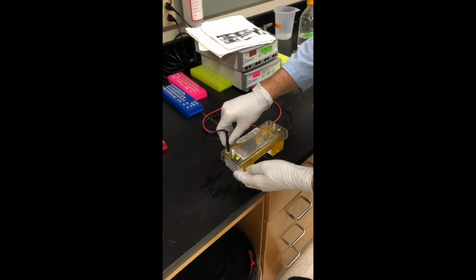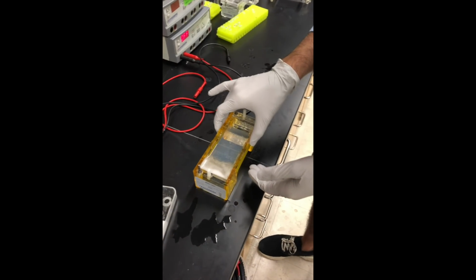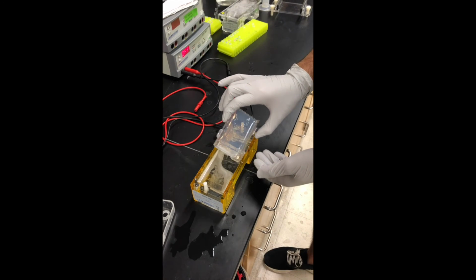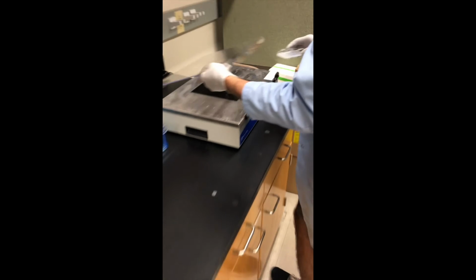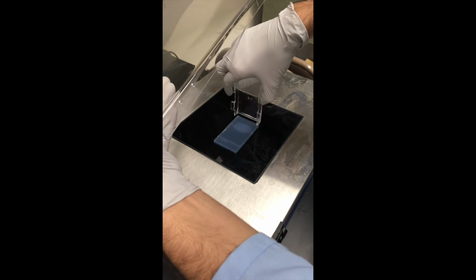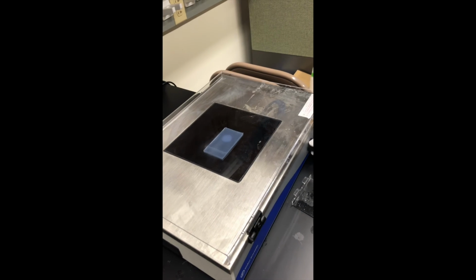So what you want to do is obviously you're going to remove these things, the wires from it. Boom. That's a fresh looking gel right there. We're going to take it out, and what we're going to need to do is run it under the UV hood. So we got to be very careful because remember, this has cancer in it. So we're going to do this. Take it over here, UV hood. We're going to deposit it like so onto there. And what we're going to need to do is turn off the lights, which is an important factor.